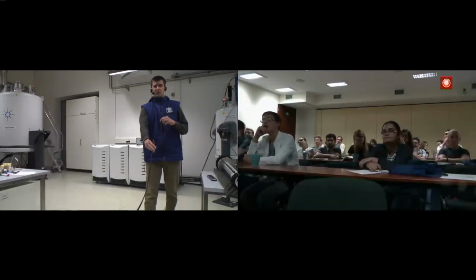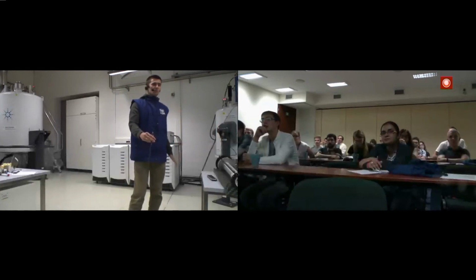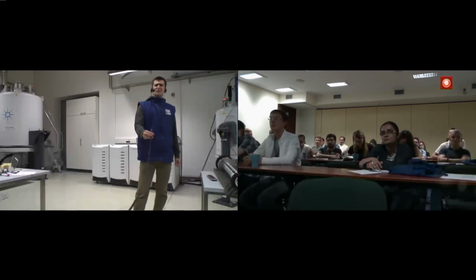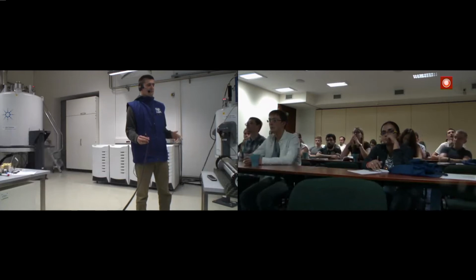I hope you can. So, hi again, guys. I have already introduced that system on Monday, so you already know that. This is our 9.4 Tesla system designed for solid-state experiments. This 400 megahertz spectrometer is equipped with the solid-state probe head. And maybe before we start those basic experiments, I would like to briefly describe the probe head itself.